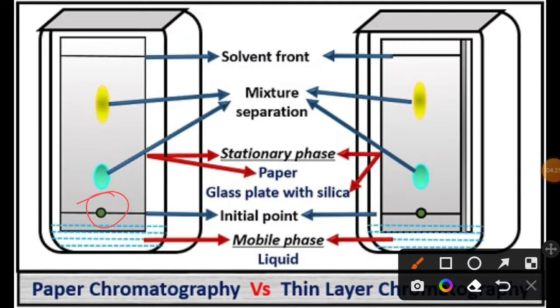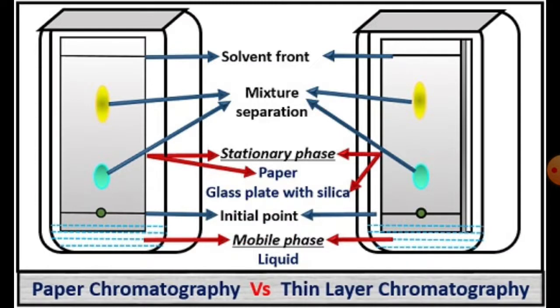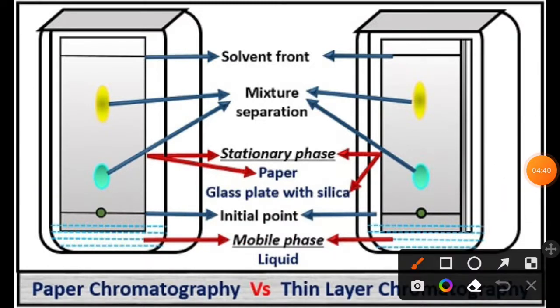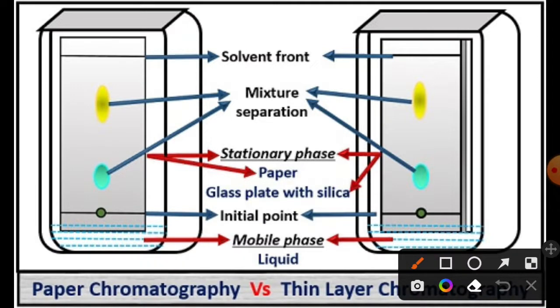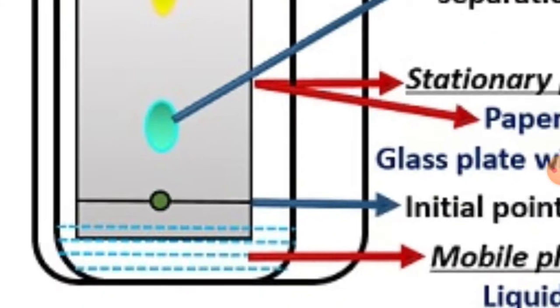Now this chromatographic paper will be placed in a jar containing a shallow layer of solvent. As you can see, this is the shallow layer of solvent. Then the jar will be sealed. So what will happen? As we discussed earlier in our blotting techniques, capillary action will occur, but this time it will not be as fast as in our Southern blotting or Northern blotting technique. It will be quite slower, so the separation will take time, there is no doubt about this.